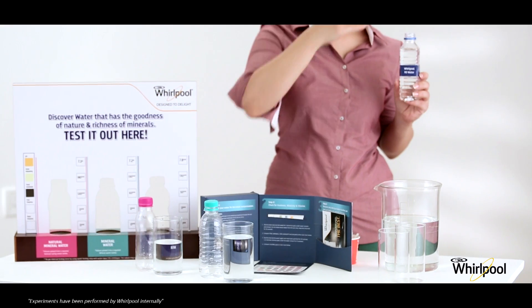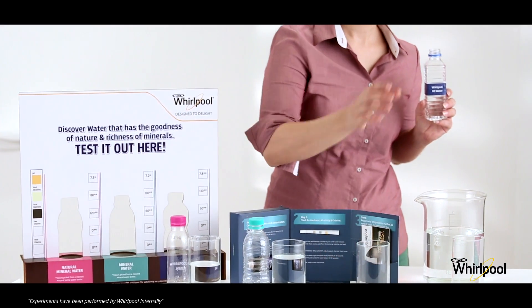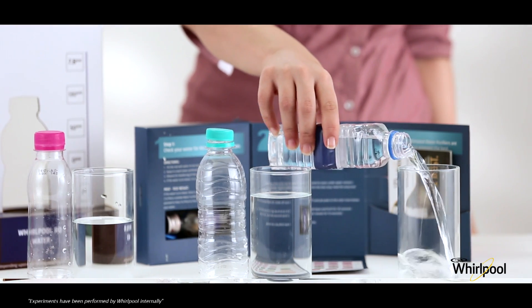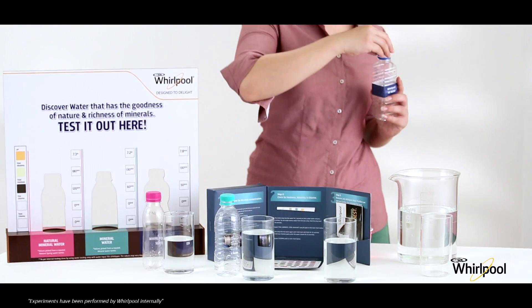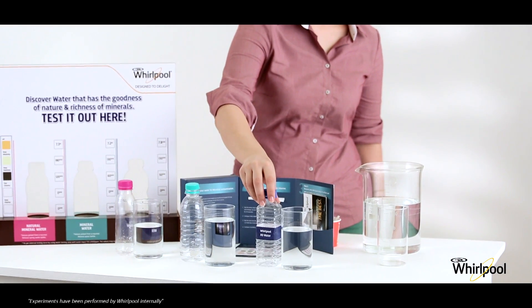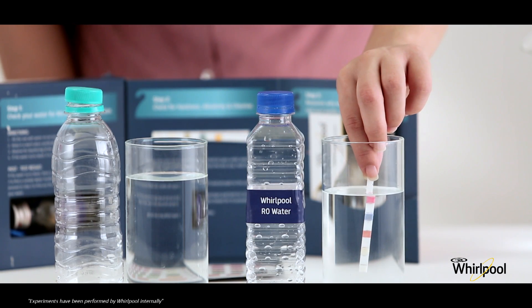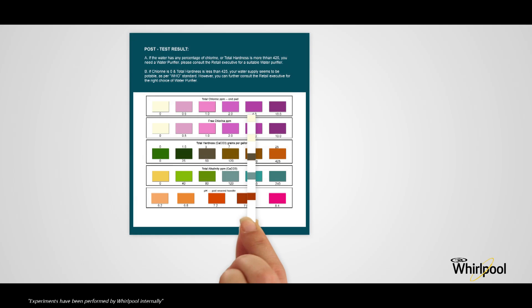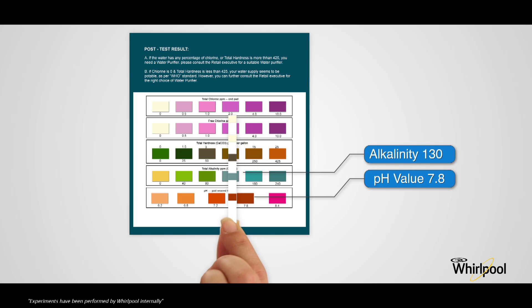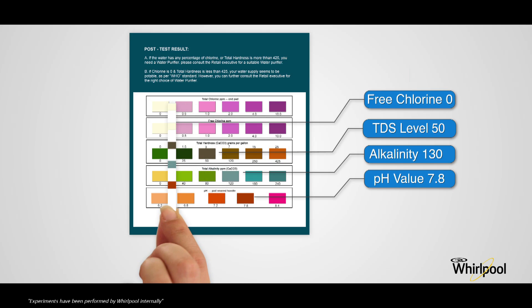In the same way, fill a glass with Whirlpool RO water, dip the testing strip in the water, and wait for 30 seconds. Then find out the levels of pH, total alkalinity, total hardness, free chlorine, and total chlorine using the measurement sheet.